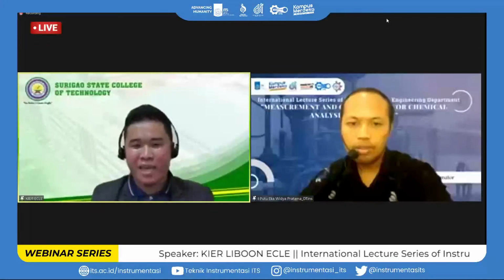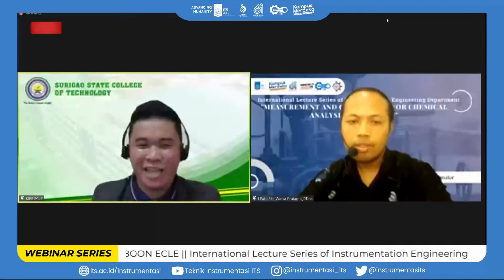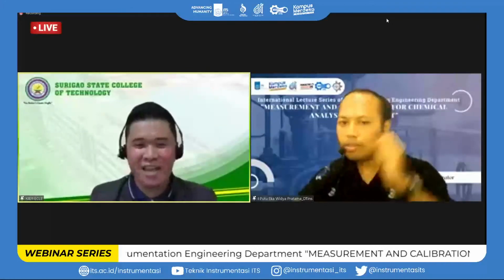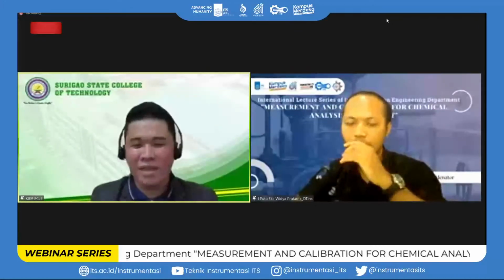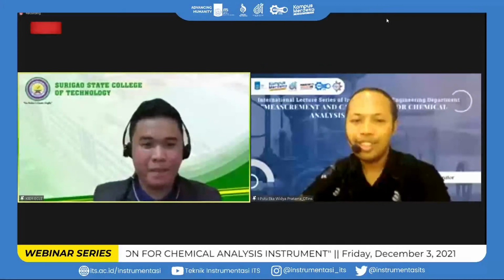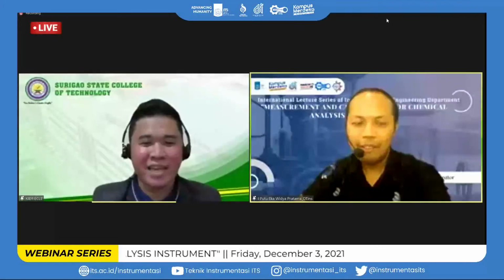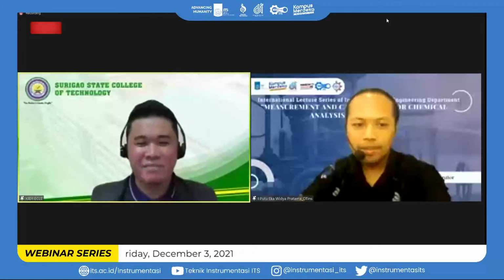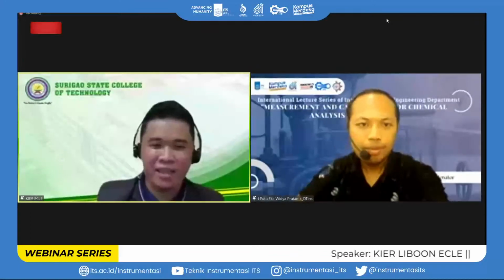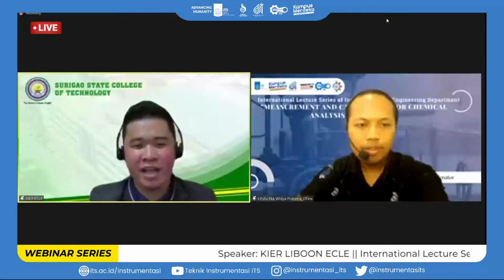It should be in liquid form. So not all substances available in your area can be read in the UV-Vis. It must be diluted first, for example in a solvent.